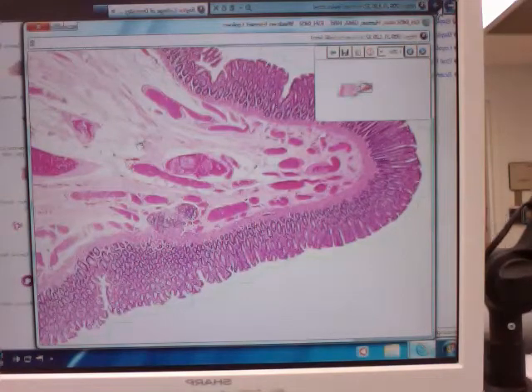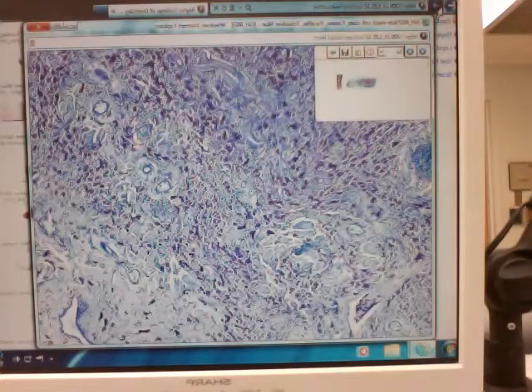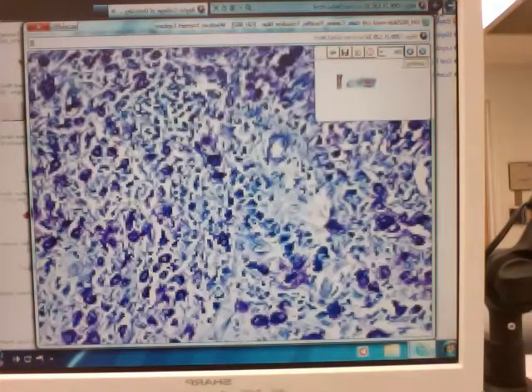The question is, can we see mast cells on this? The answer is no. I wouldn't have even done mast cells if you hadn't asked me about it. But whatever slide that is, I'll find it at some point. Here we go. Okay, folks, anybody who misses this one, it's really good. It's going to be sad.